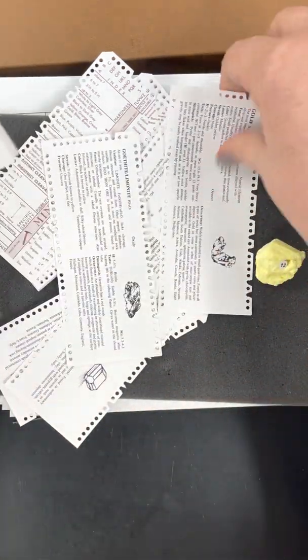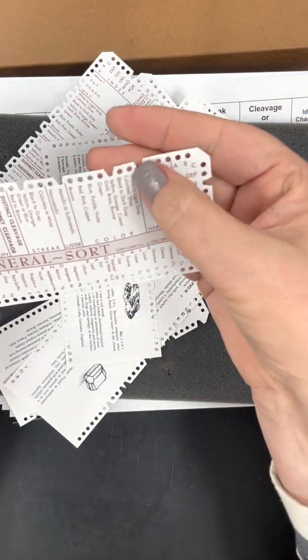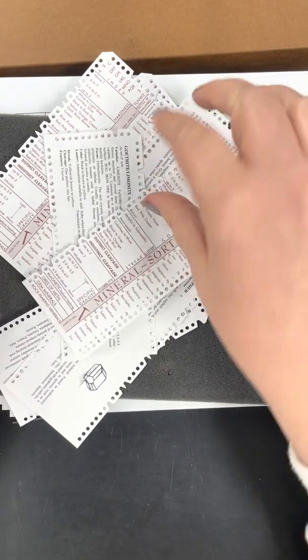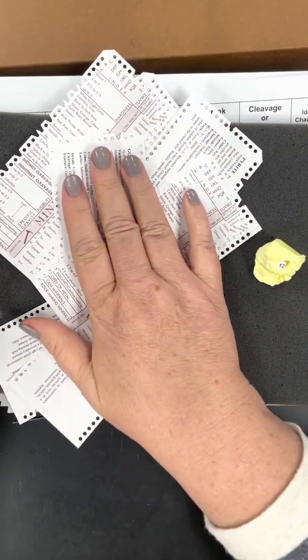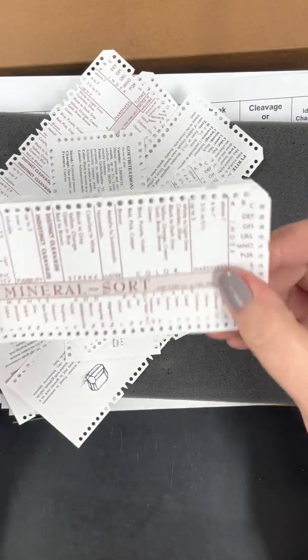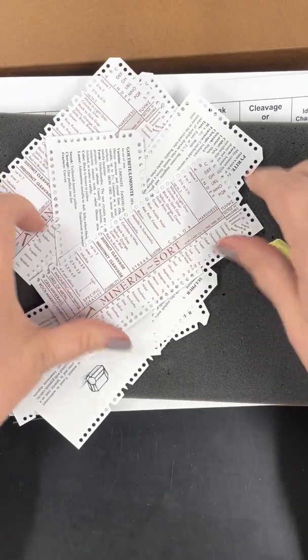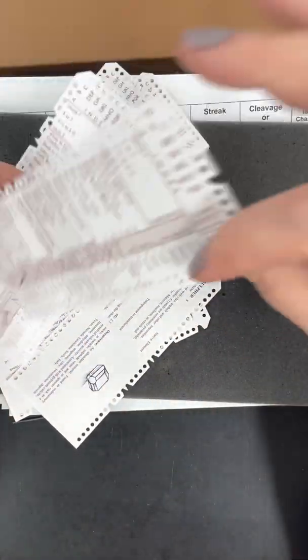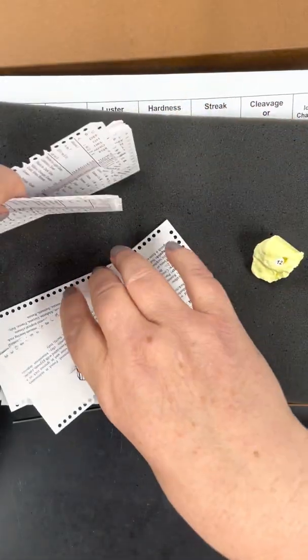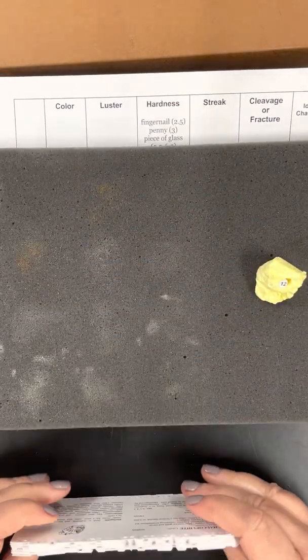Okay? If you look for color, see where the yellow was notched out. So all the minerals that are yellow are in the pile that fell. These that are not yellow, I'm going to put off to the side, and I'm going to gather these up and get ready for the next one. So in your color, go ahead and write down yellow in your data sheet. And then let's move on to luster next.